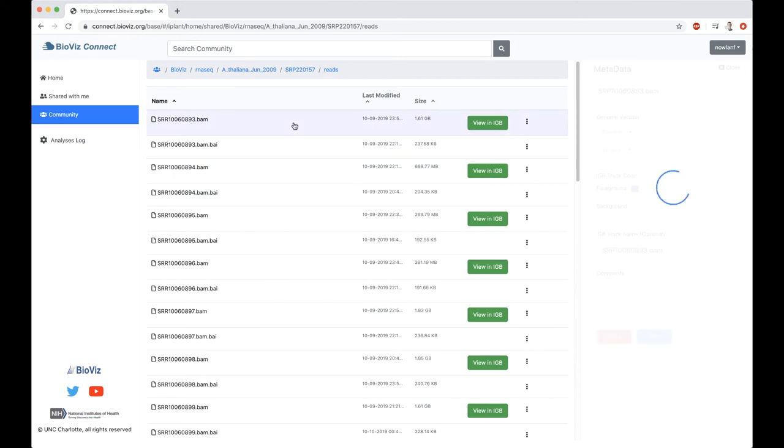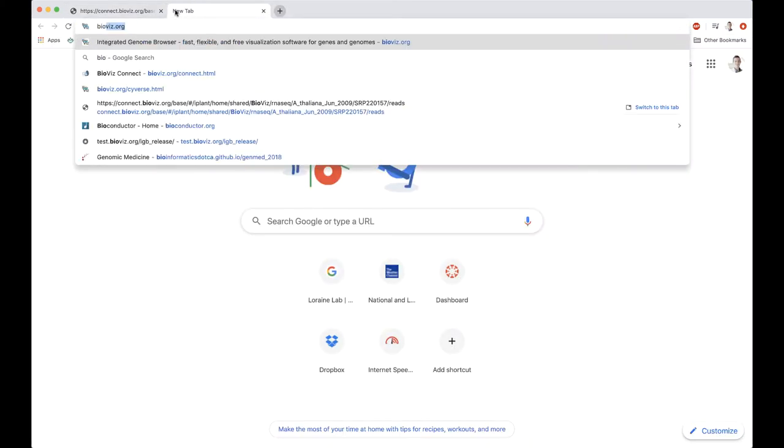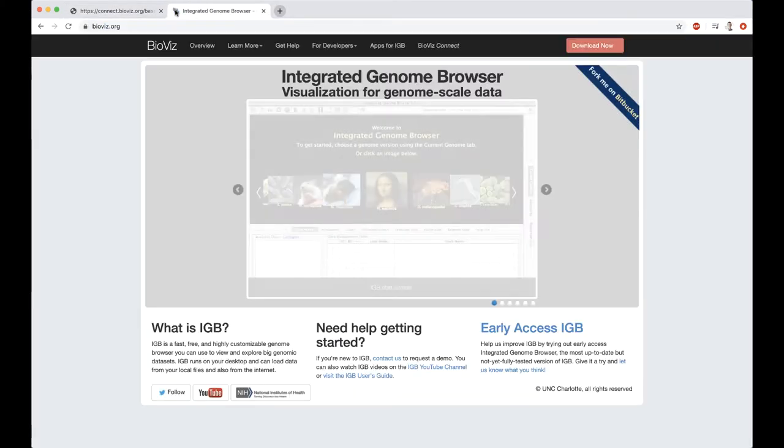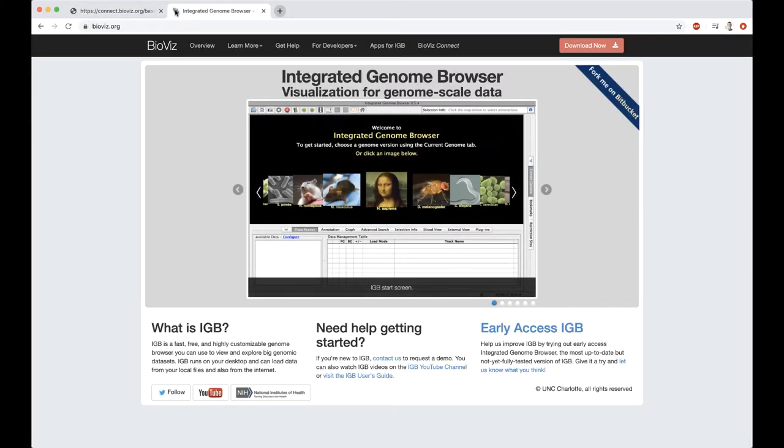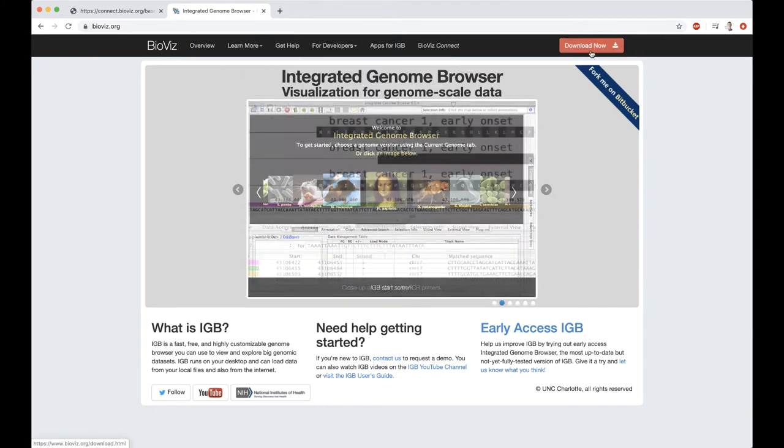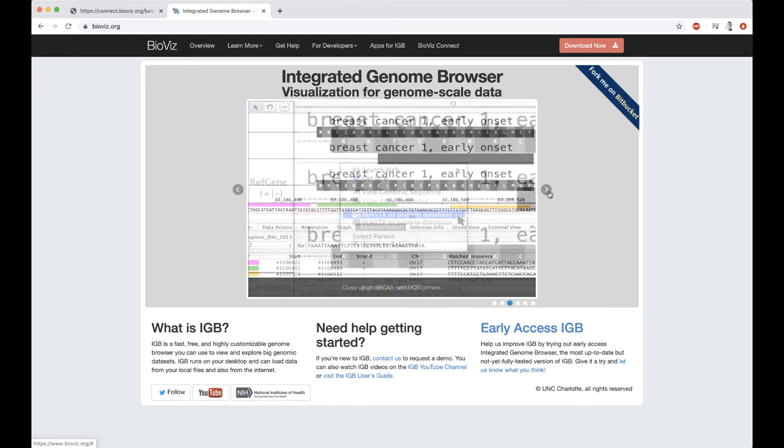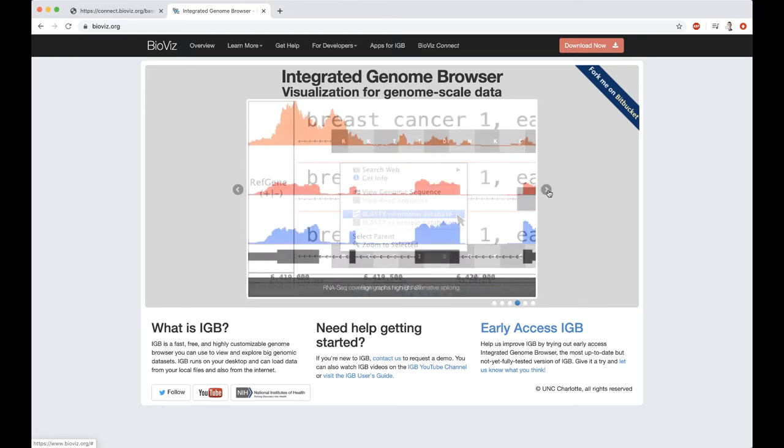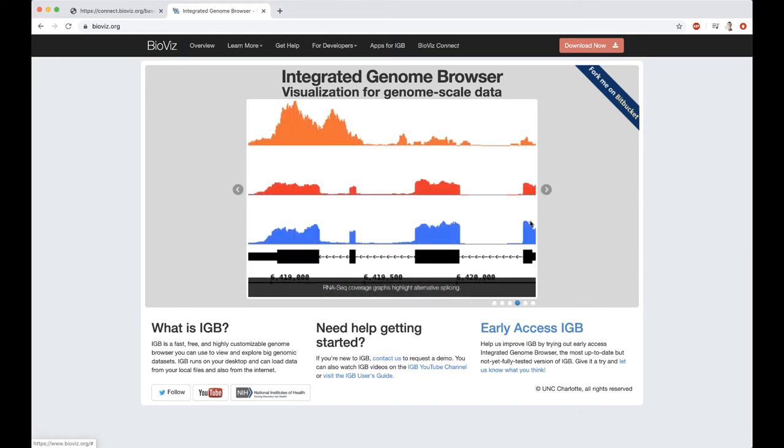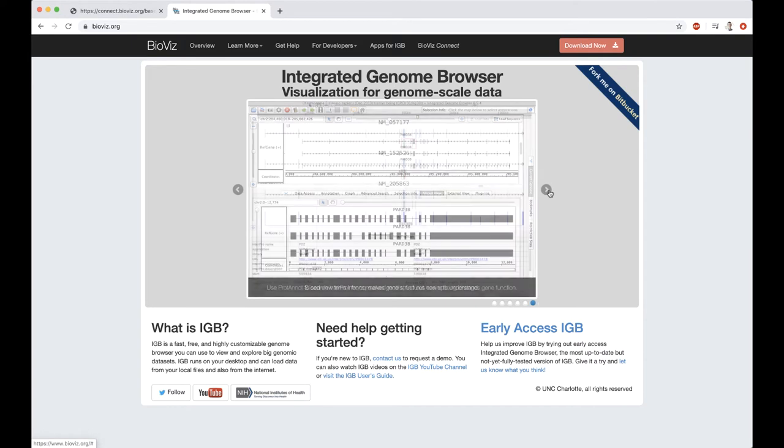In order to do that, we want to view this data in IGBE. If you haven't already installed IGBE, if you'd like to continue to follow along, you can go to bioviz.org and click on Download Now to download the Integrated Genome Browser.